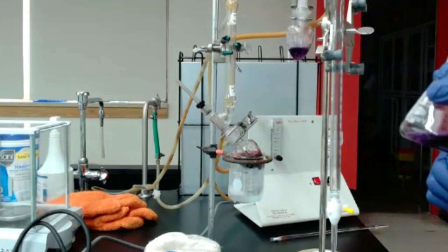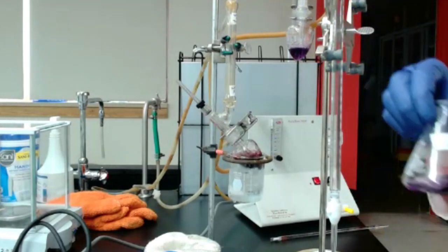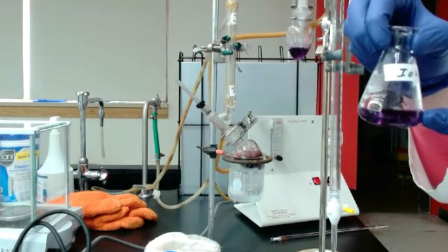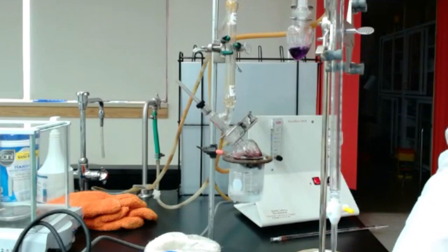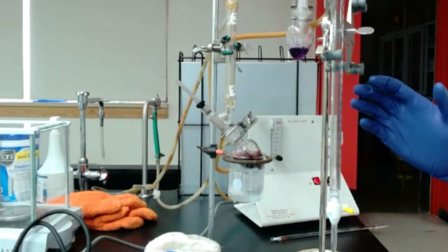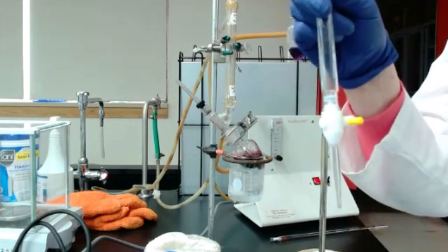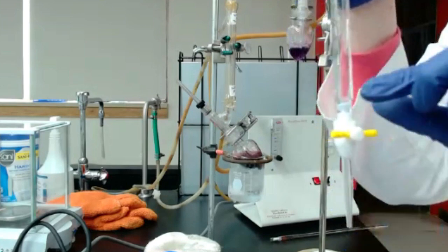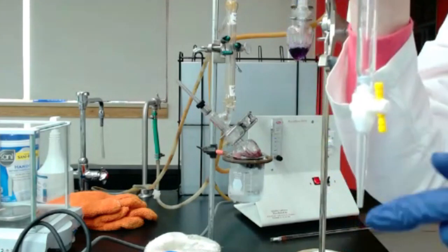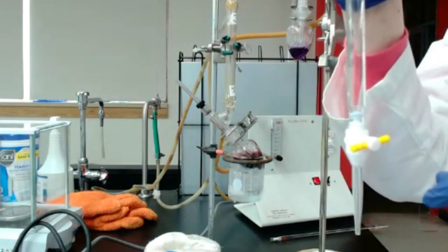Once you have that, you're going to do a titration with sodium hydroxide. What we are doing is measuring how much sulfuric acid we have in that solution. To know how much sulfuric acid we have, we're going to do a titration. To do a titration, you need first to have a burette. So burette, that's this system where you have a tap here, to open and to release a few drops. Make sure it's closed before starting to do anything.